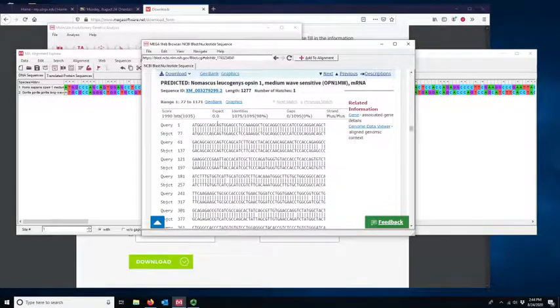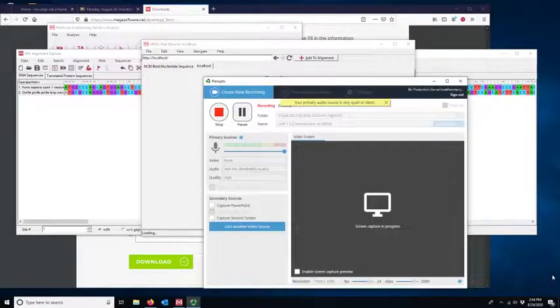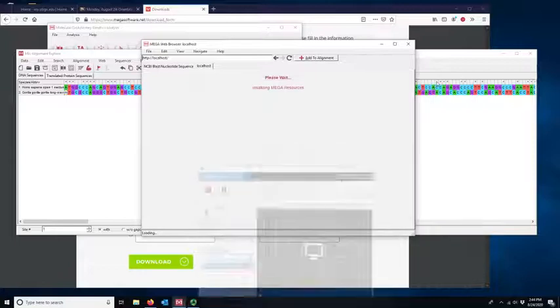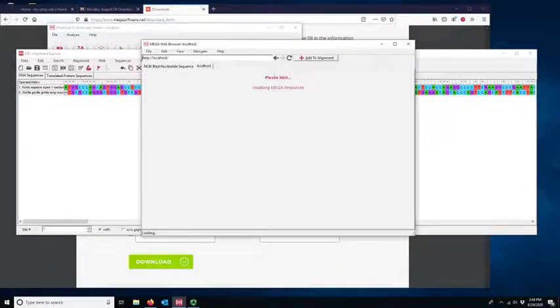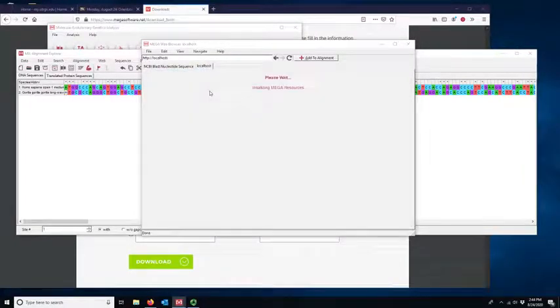So here it is. There's the matches that it's making. I'm going to click on the link to the sequence. Try that again. There's the link to the sequence.